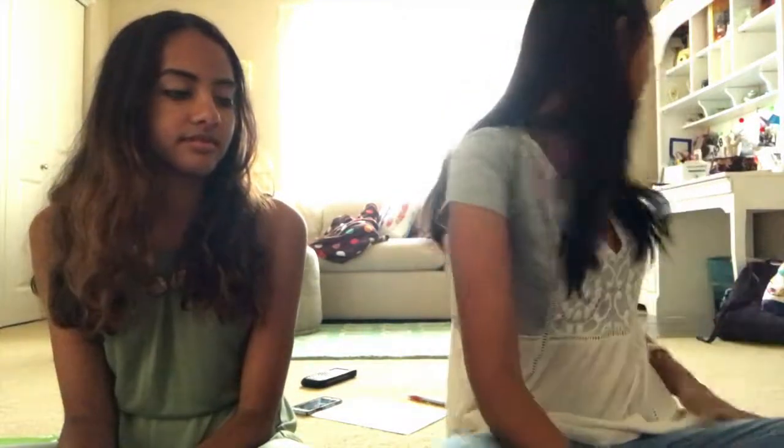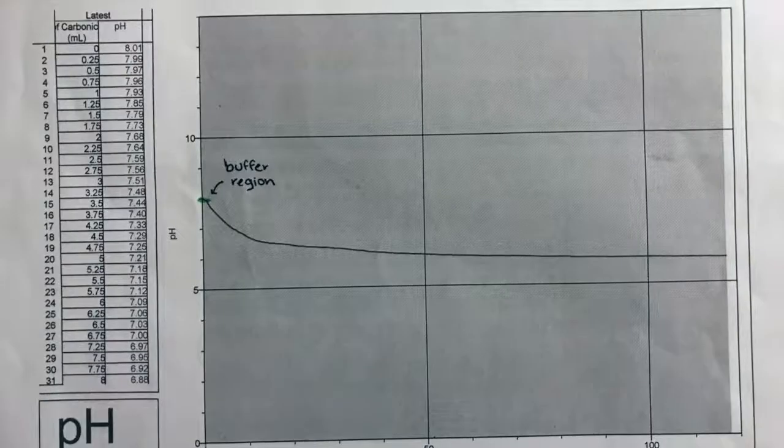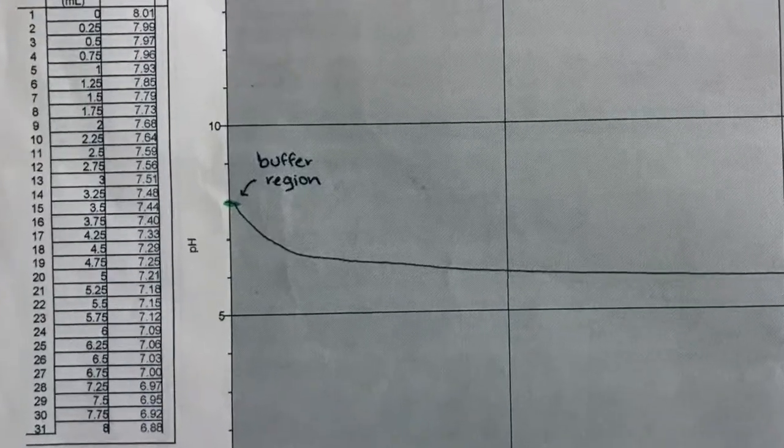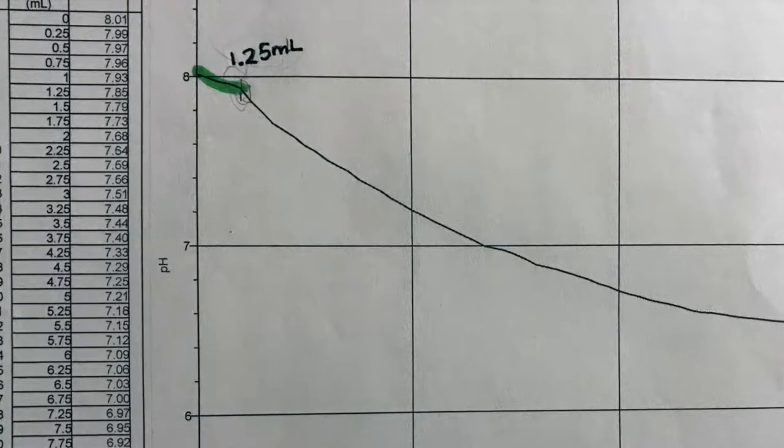After that, we titrated just carbonic acid with seawater, which is a weak-weak titration. That also created some error because it's hard to analyze something that doesn't have as steep a transition. As you can see, our graph that is not zoomed in looks like this, and if you look really closely, that's our buffer region — which, zoomed in like crazy, gives us that. And that little thing is our buffer region, which is about the size of my fingernails. That created its own problems, but ultimately the weak-weak titration was the way to go.